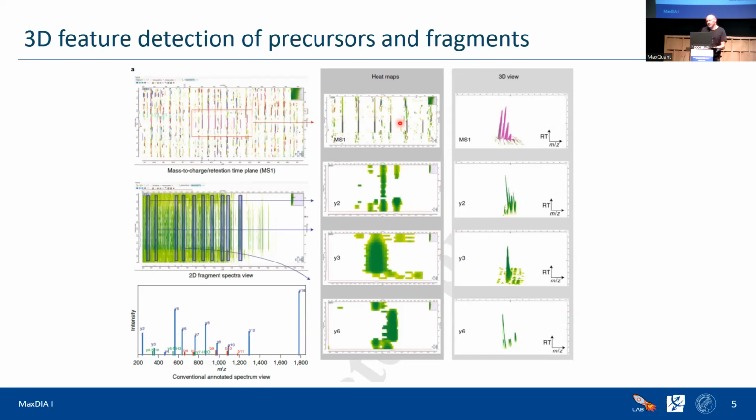And also we have a bit better control over how to use the intensity of the fragments, because we now know what part of the raw MSMS data is actually corresponding to one feature, right? And then we can make sure that we don't overinterpret the data, because we can now require that this feature is used only once for interpreting a library spectrum.